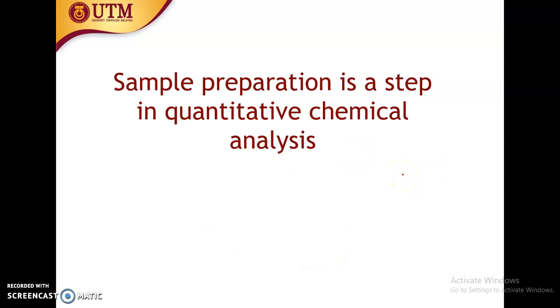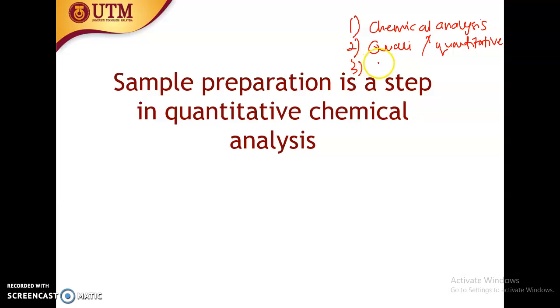So at the end of this topic, you will learn about what chemical analysis is, whether it's qualitative or quantitative, and which one is needed most in forensic science. And then you will learn about the 9 steps in chemical analysis, which involve the sample preparation that I will cover today.